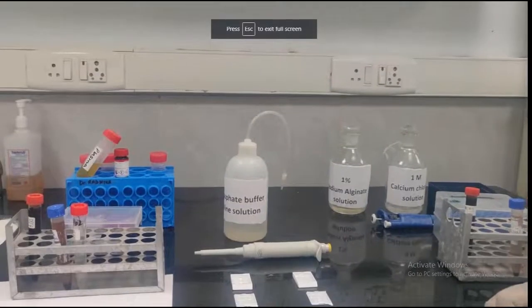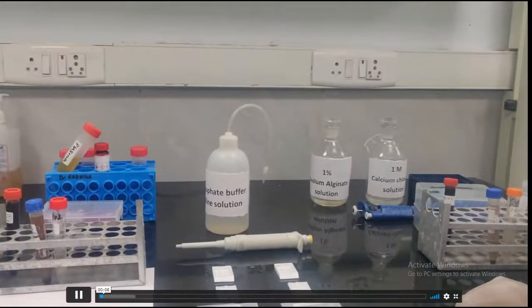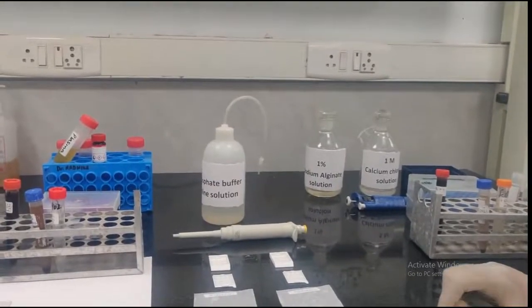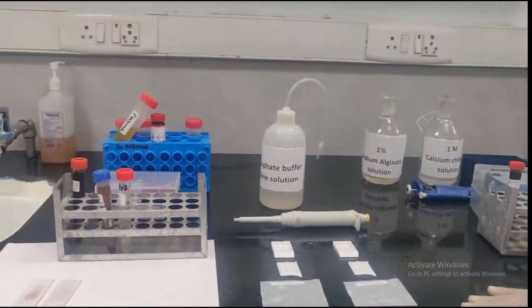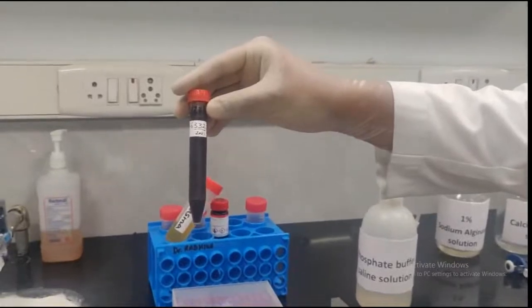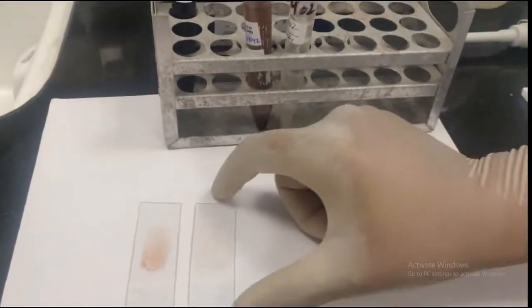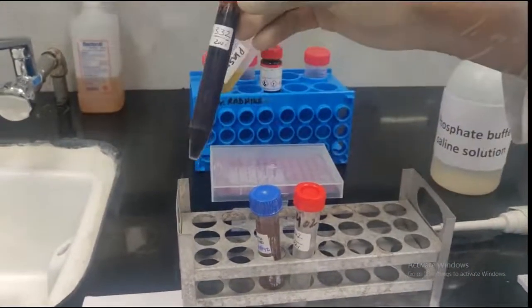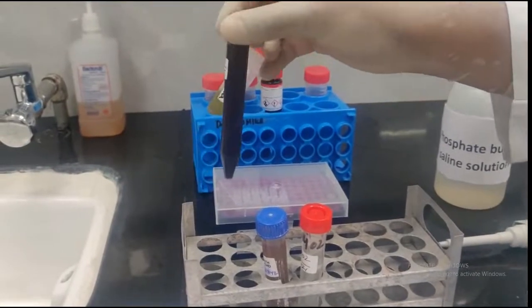Good morning, everyone. I will be demonstrating the plasma thrombin clot method, or the plasma thrombin method, for cell block preparation. So this is the setup that we will be using, and this is the sample that we have taken in 10% neutral buffered formalin. After preparation of the adequate number of aspiration smears, we rinse the needle in 10% neutral buffered formalin solution that has been added to this falcon tube.